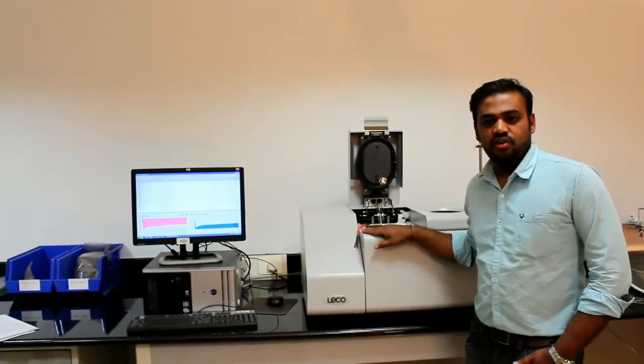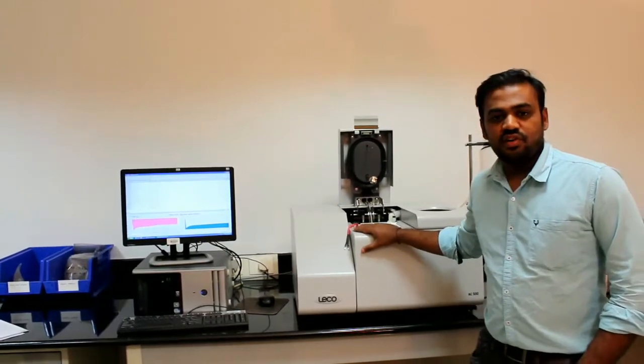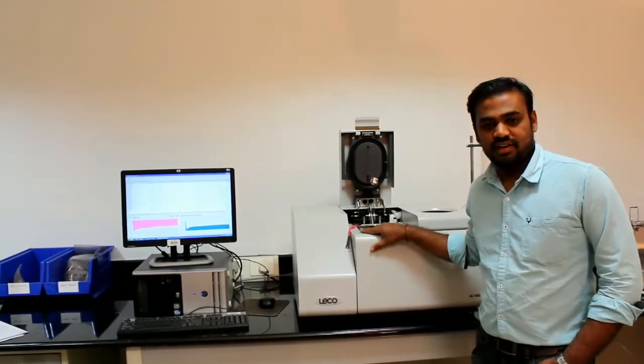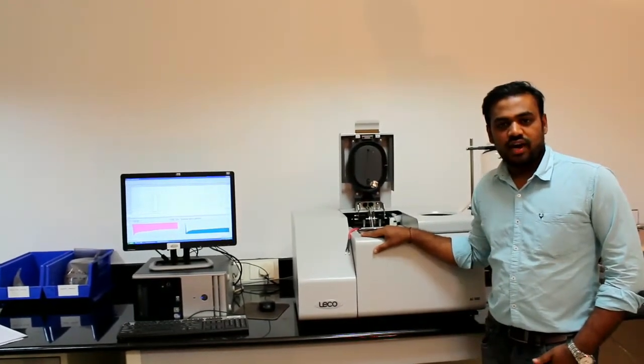Hi, I am Chetan from Leeko India Service. This is our Leeko Benztop Bomb Calorimeter. This is a Windows-based instrument developed to measure the calorific content in various organic materials, such as coal, coke, and fuel oil.